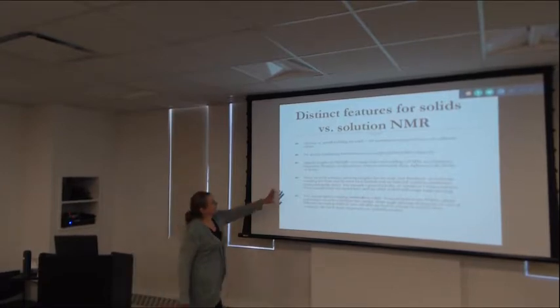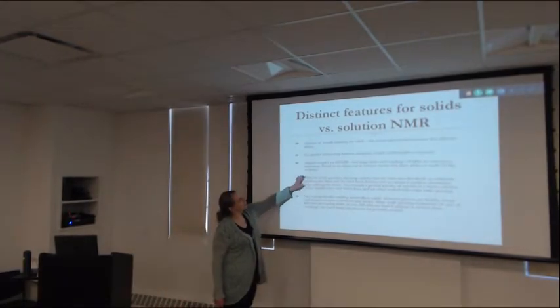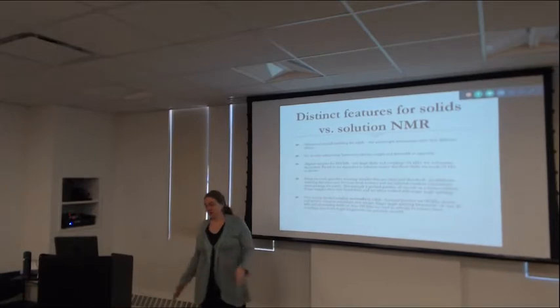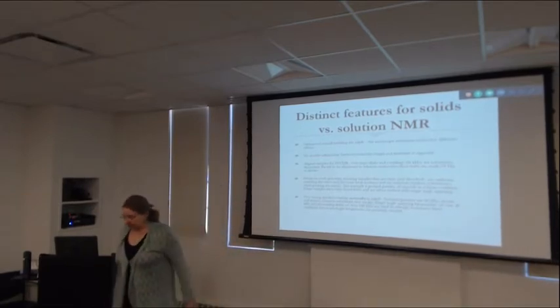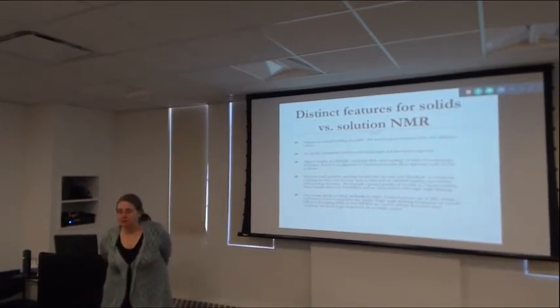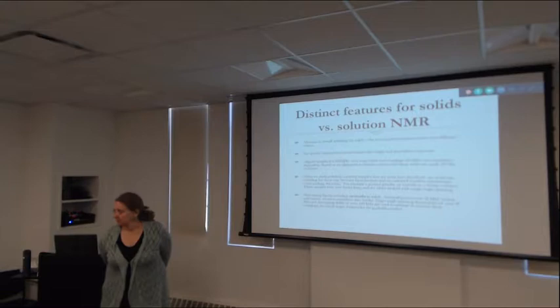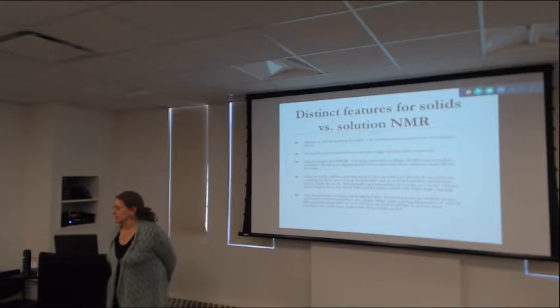So this is a magic angle spinning experiment, a typical format. This is the so-called static NMR typical format. For both of them, in the spin physics, the distinguishing feature compared with solution NMR are the networks of very strong through-space dipole couplings. It's not just one coupling. So when we do the math today and next time, we're going to be talking about an isolated coupling.